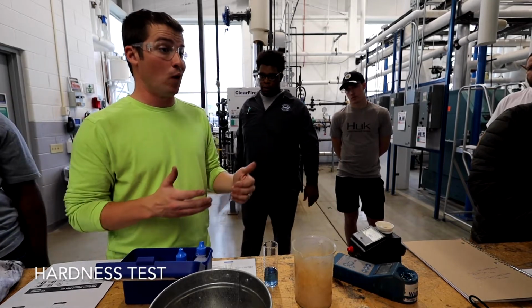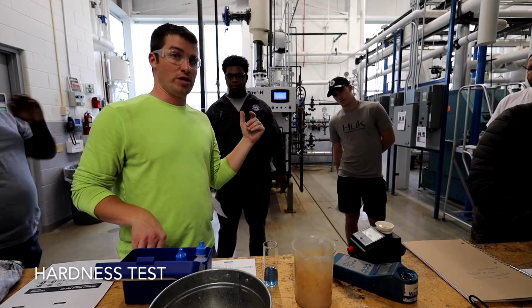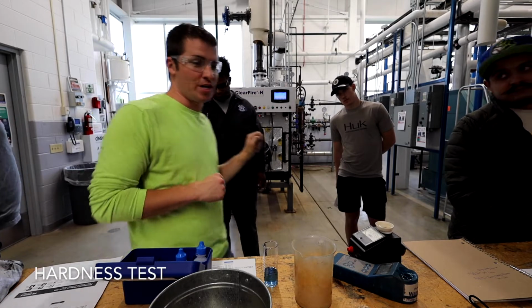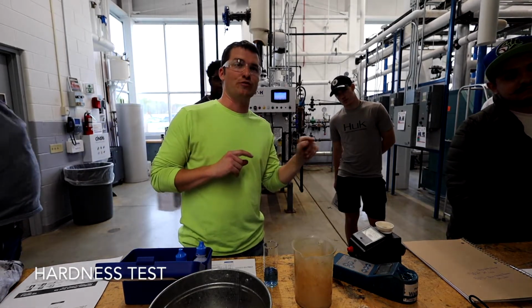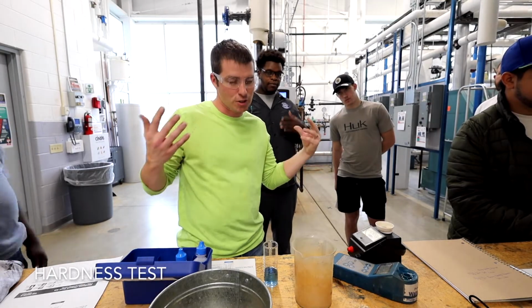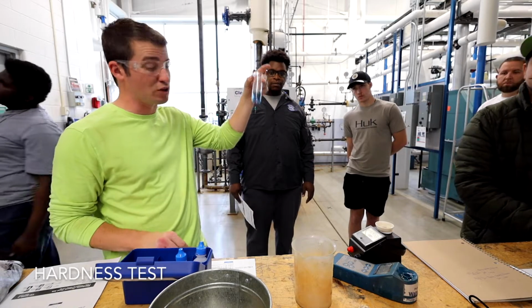Elevated higher than we want, but again, Lake Michigan water coming in is 140. So I'm gonna guess the softener for the most part is working. It could have been just the initial fill. You might have exhausted the softener quicker than what it could keep up with. So we put a little hardness into the water. But we'll test the softener, right? So obviously you can see it's clearly blue.